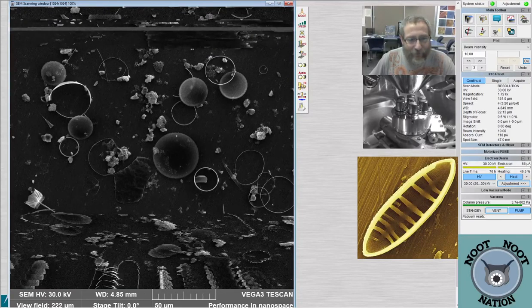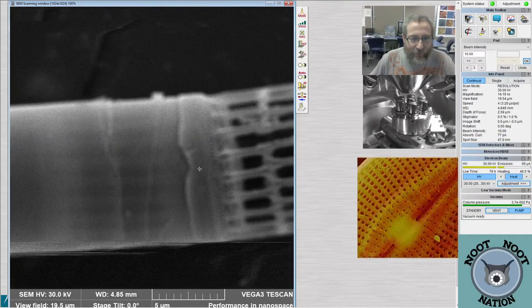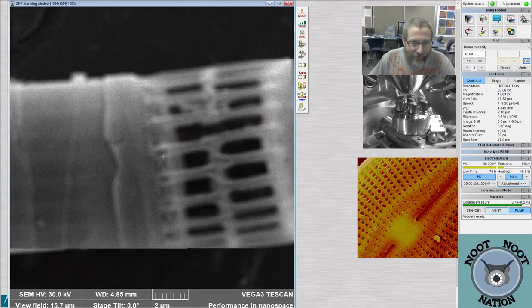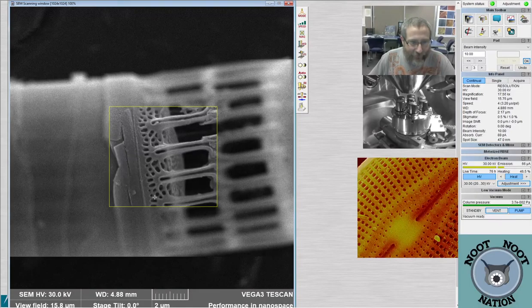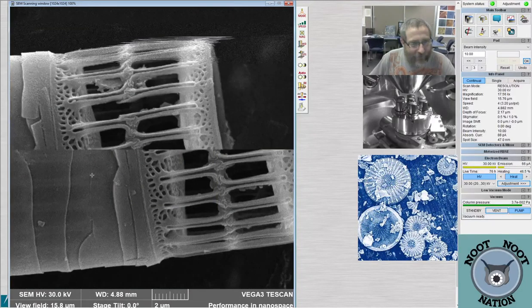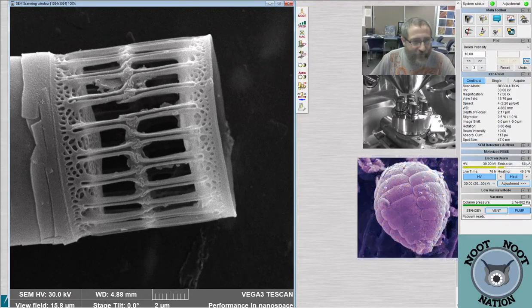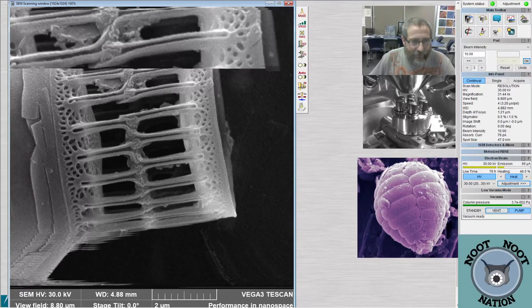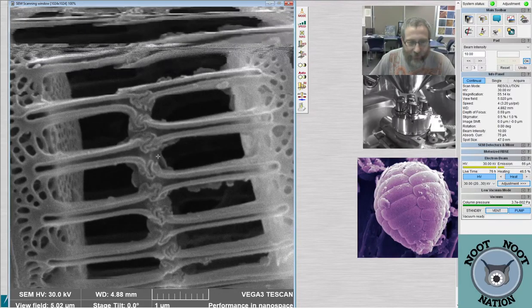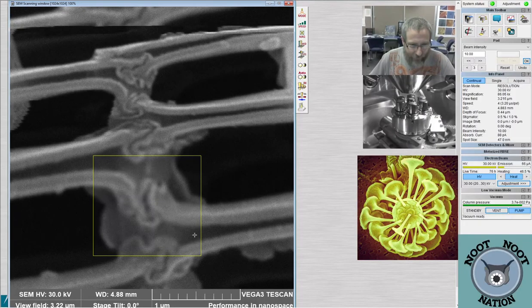Leaning Tower of Pisa one. Maybe they were talking about a skeletonema. It does look a little bit like a Leaning Tower of Pisa. We can zoom in. We haven't ogled any skeletonema up close. Oh, they're so beautiful, and will be when I get it in focus anyway. This is a ridiculous-looking diatom up close. We cut it right on the valve face, but the cell's broken on this side. And we can get kind of crazy close to looking at the spines on this one. There are a lot of skeletonema in these samples, so... Yes.